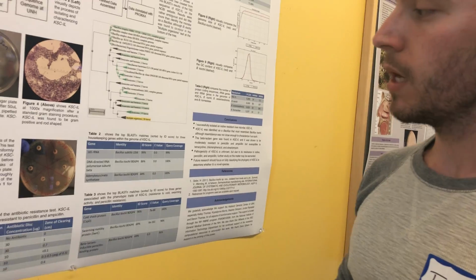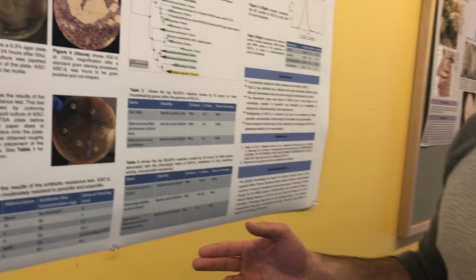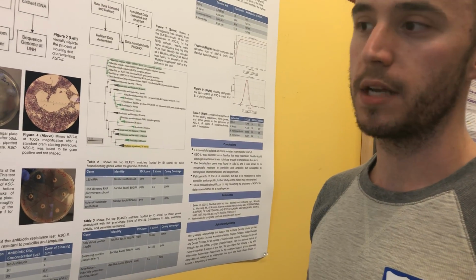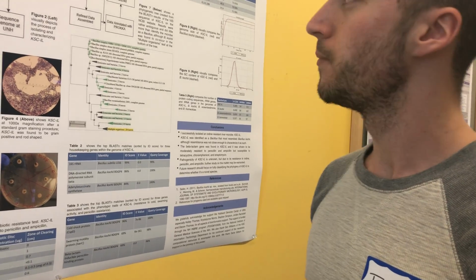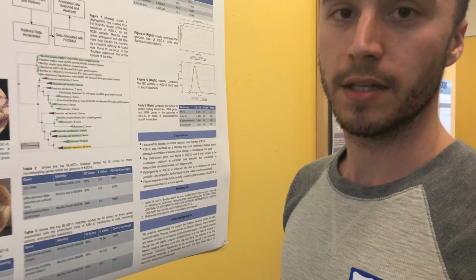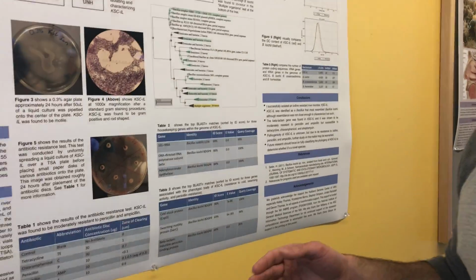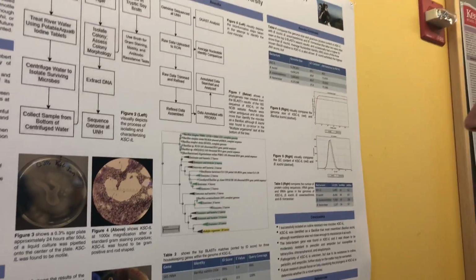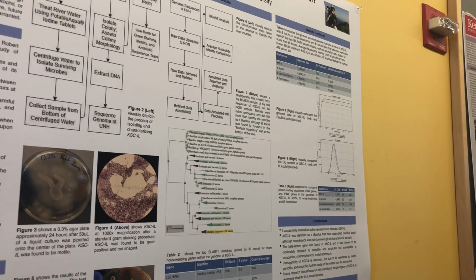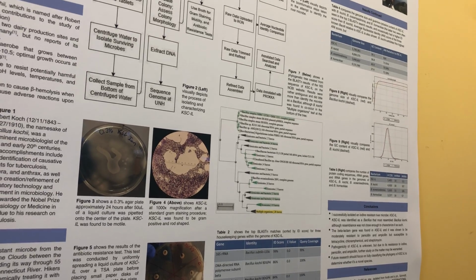and hard to treat. So after I categorized it phenotypically, I also wanted to look at the genetics of it. So I isolated the DNA, extracted it, and then I sent that to the UNH Genetics Center, Hubbard Genome Center. And they sequenced everything fully, put it on their server RON. And I looked at that server and got the entire genome. And I trimmed it using a program called Trimmomatic to make it a little bit neater, a little bit easier to see. And I then assembled all the sequences of DNA into contigs and annotated it using Prokka. So that was able to let me look through the genome and find certain genes.